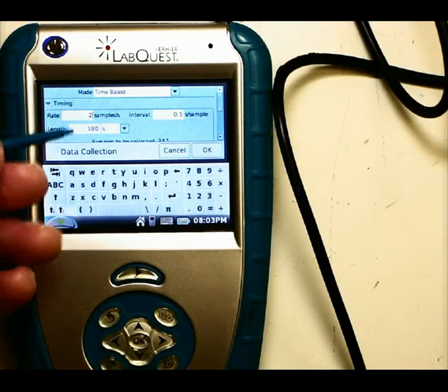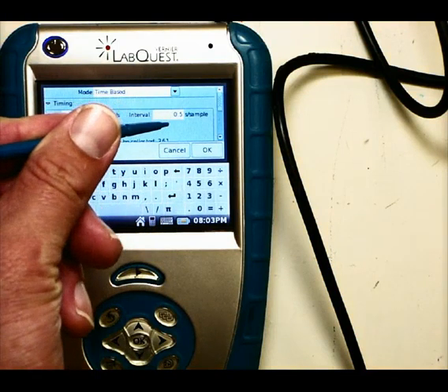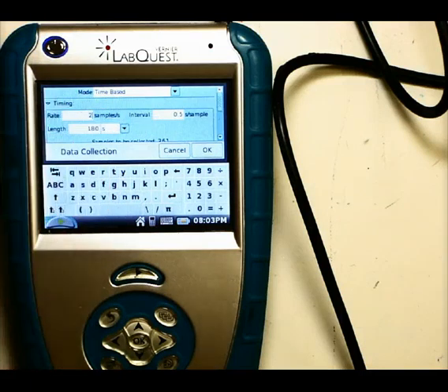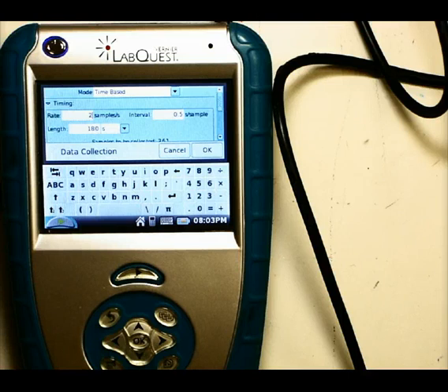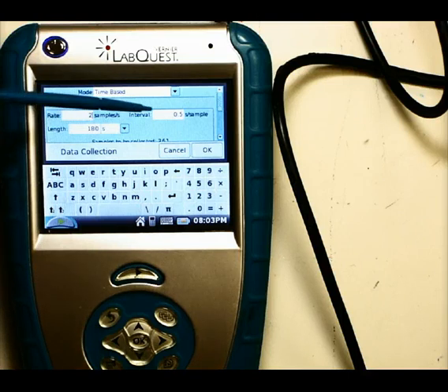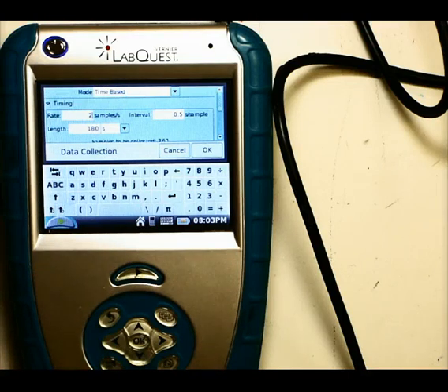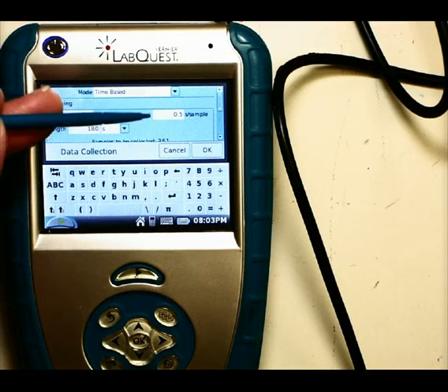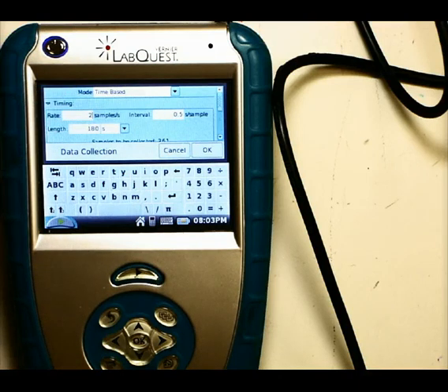Notice that as I change the rate, the interval changes as well. These two are just different ways of measuring the same thing. Interval is how long in seconds you want to go between samples — in this case 0.5 seconds per sample. So the LabQuest waits half a second, takes a sample (meaning takes the temperature), then waits another half second, then takes the temperature, and so on. Whichever one is easier for you to think about, you're welcome to use.